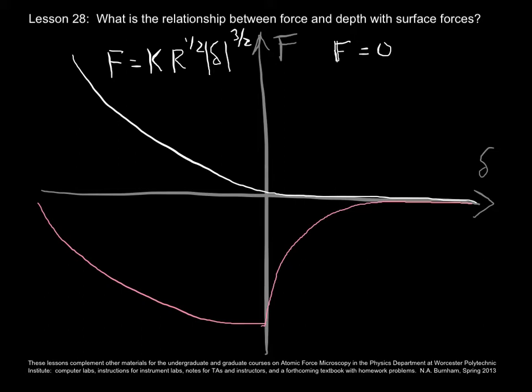That same shape as the Hertz mechanics in white just gets shifted down, and you add perhaps a van der Waals interaction. The problem, however, comes in this area down here. That's a discontinuity in slope, and I have never seen that in experiment other than discontinuities in the sense of instabilities.